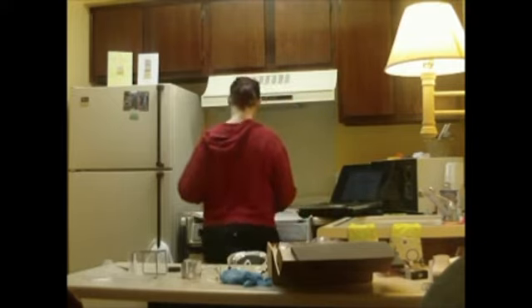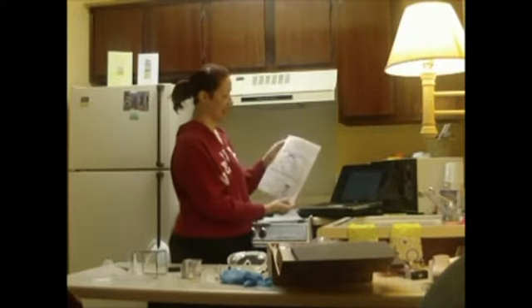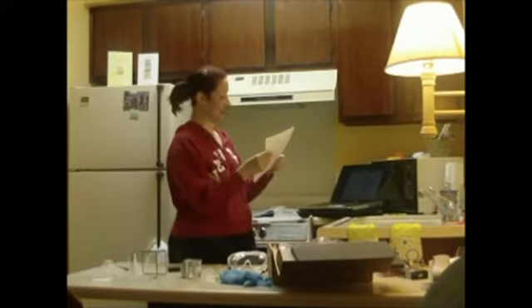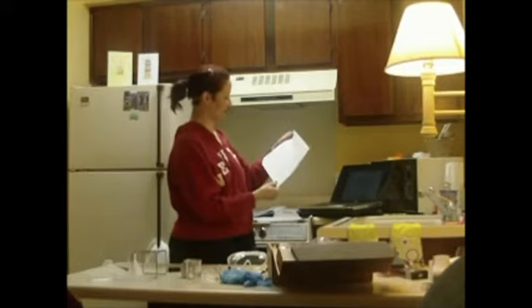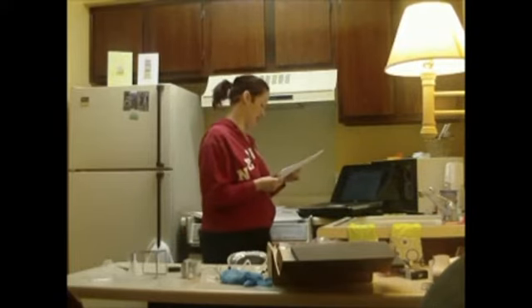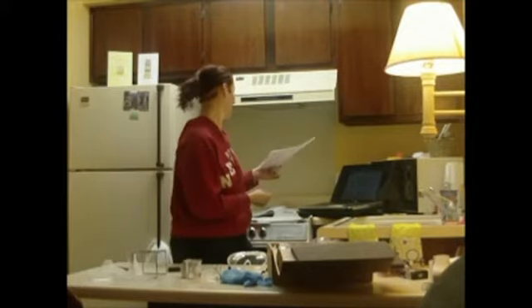Oh, and of course, I already filled out all of my pre-lab questions here. I actually did this like last week or something, but now I see how it would make sense with this lab. We have a whole chart here with our physical and chemical properties. And it looked like when I looked at this experiment, that made sense with the items on here.